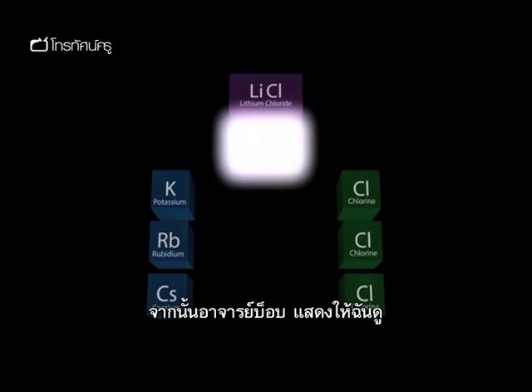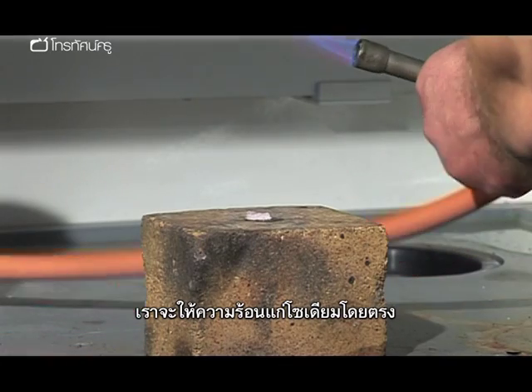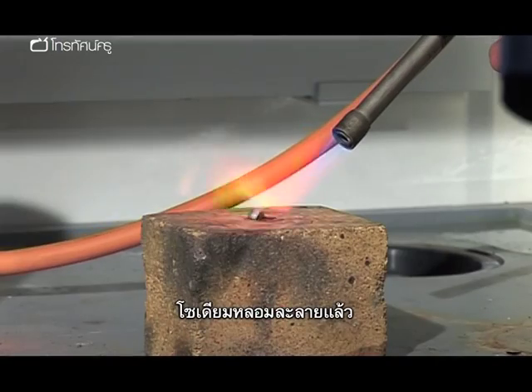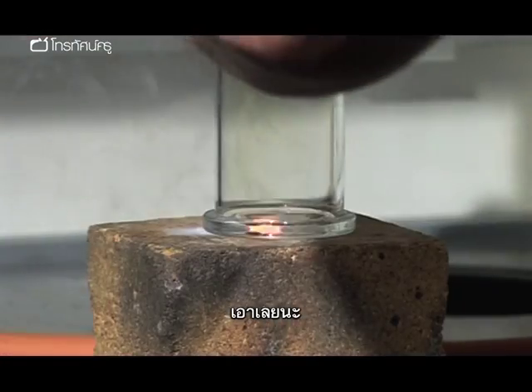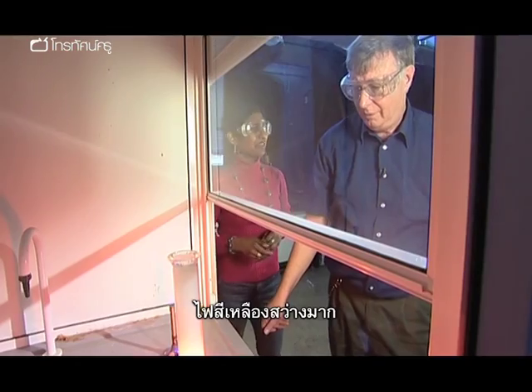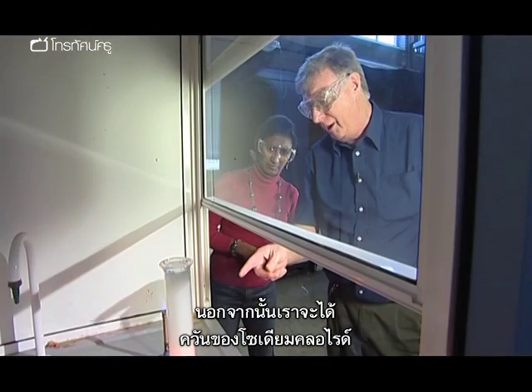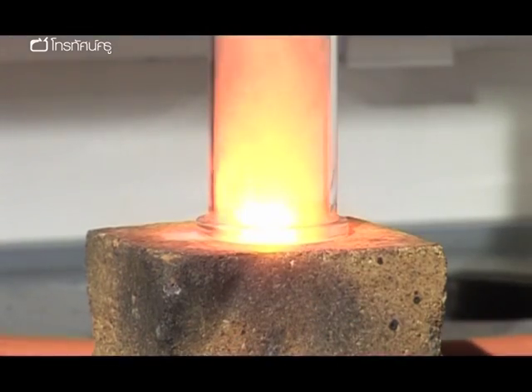Bob then showed me a very simple way of reacting sodium with a gas jar of chlorine. I'm going to now heat the sodium directly. Now there's the molten sodium. And here we go. That's fantastic. It's very bright yellow. Yeah, it was yellow flame test. Exactly. And also we're getting the smoke of the sodium chloride. So that's what you're seeing that's white on the top? That's right.